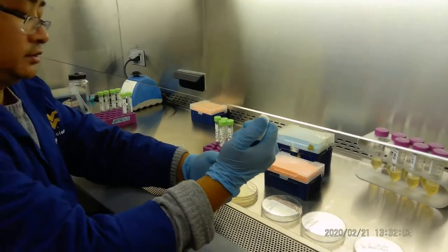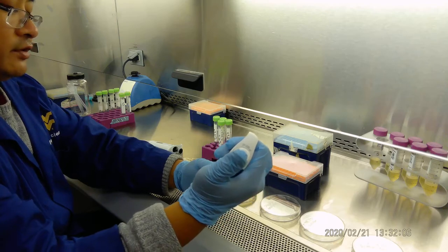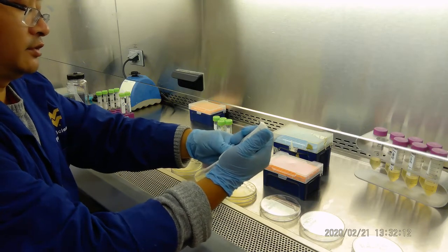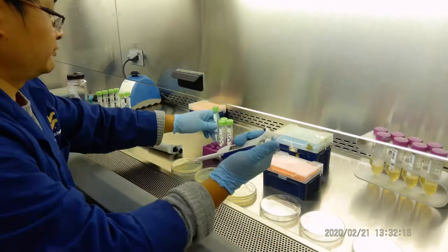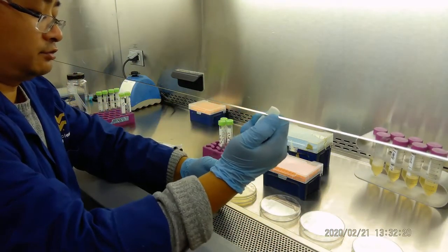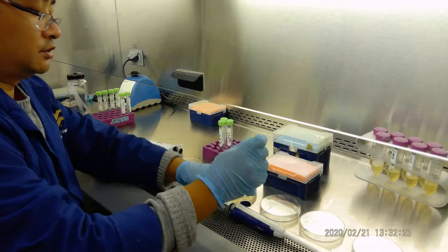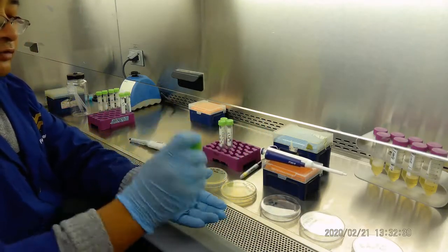Okay, we get one. We use the little finger. You're going to get one from there. Okay, little finger closed. Take a picture. Use the little finger closed. Okay, then we do the first one. In the lab we have a vortex, but in the teaching lab we don't have it, so we will just shake it. We're going to shake it very well.